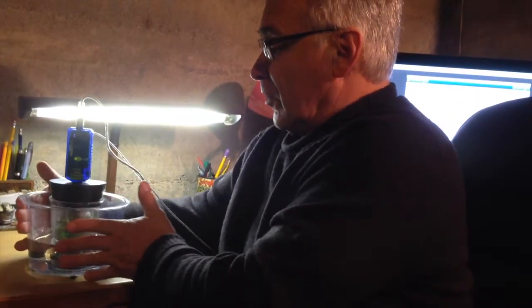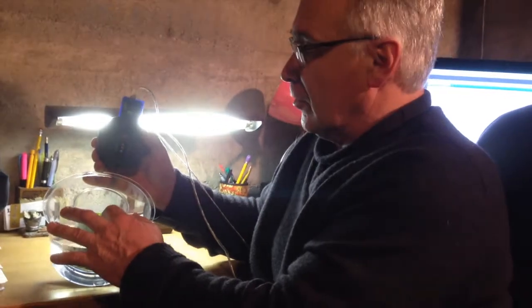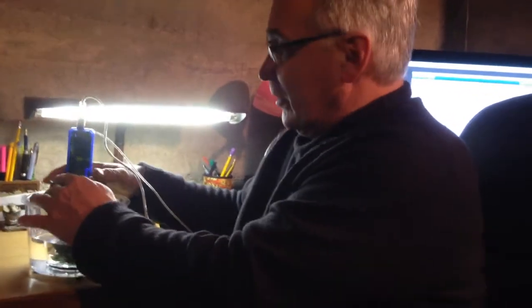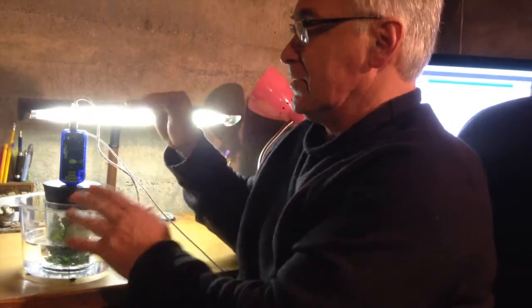So what I'm going to first of all do is stuff this little inner cup with our good friend, the spinach plant. Put a little bit of water in there. Then I sealed it off. Then I put some water around here so that we can make sure the temperature pretty much stays the same.